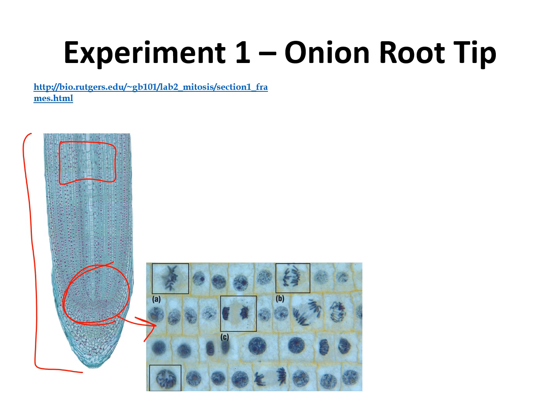But go to that site, magnify this area, and look around in that area until you find cells showing the different stages. Then on your lab, in the circles that are on your lab report, you are going to draw a cell in each stage.